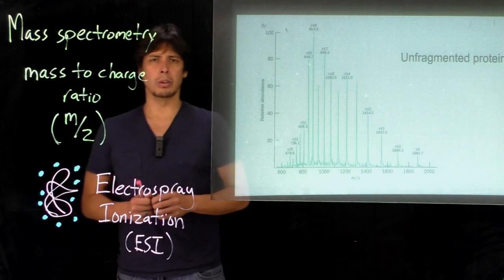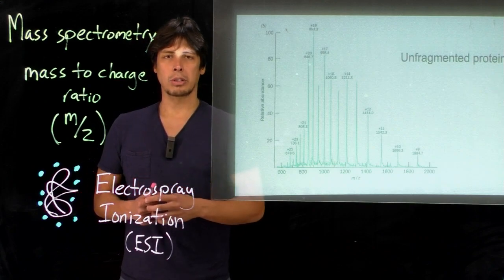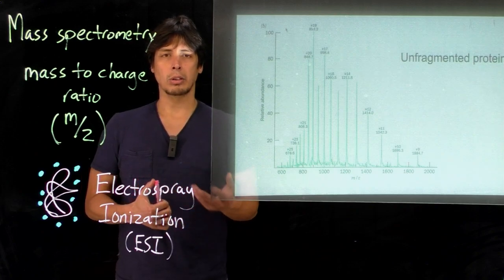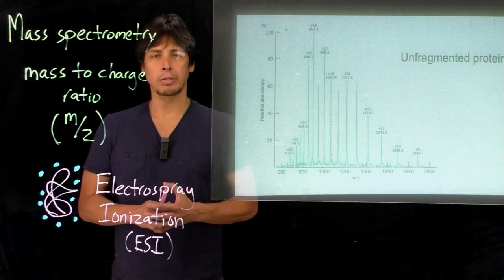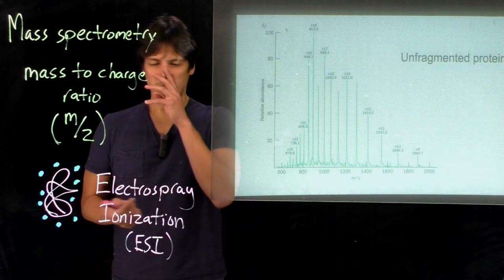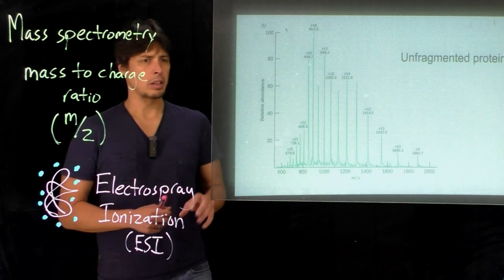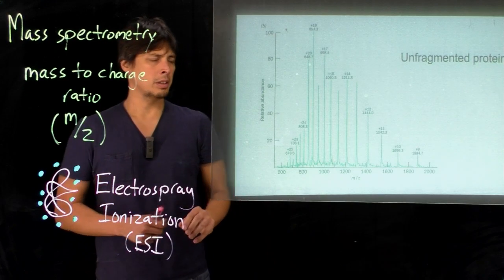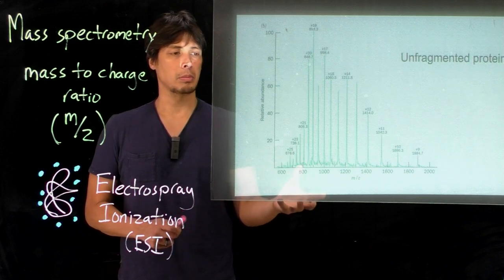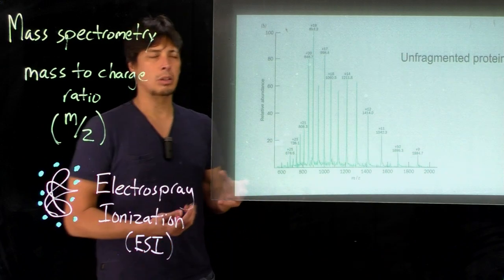What that also does, though, is give you a distribution of charged residues. In particular, basic residues such as arginine or lysine tend to be in different states of protonation or deprotonation as this happens. And so what you get is a different charge distribution for the mass. The figure on the right is what's called a charge envelope. This is a spectrum from a mass spectrometer of apomyoglobin, and this is in your book.